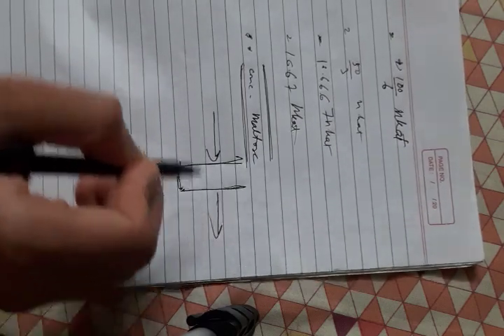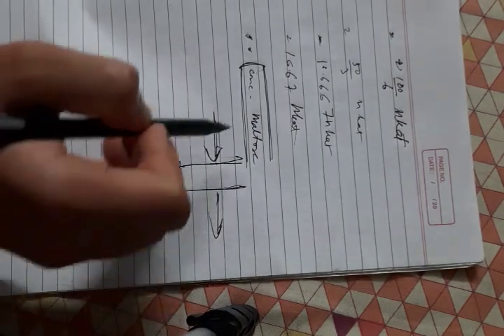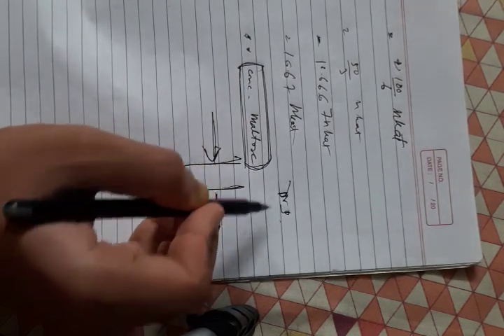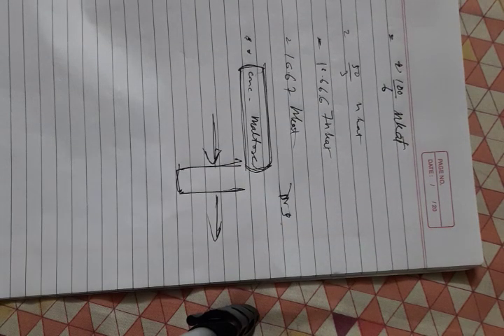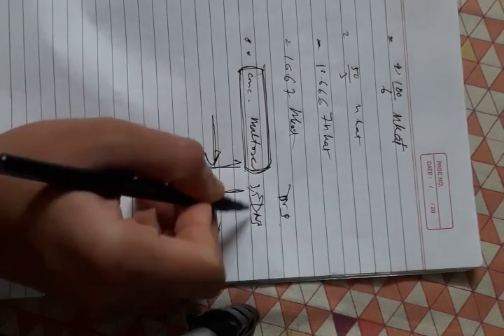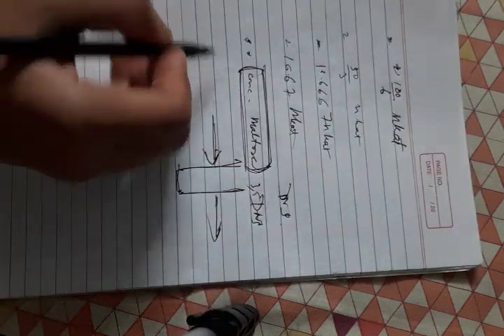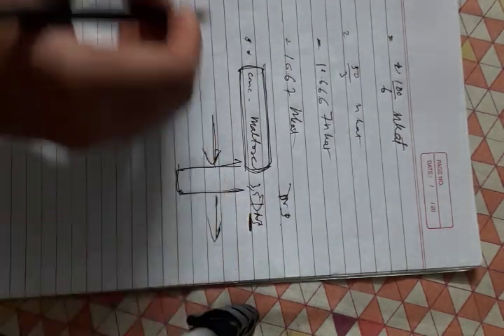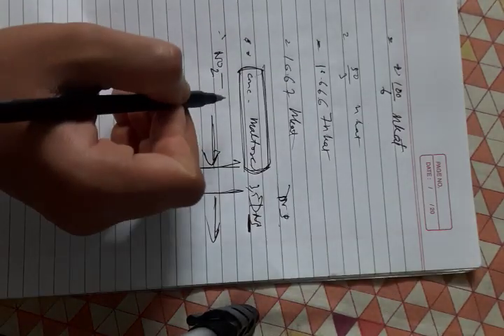a spectrophotometer. Okay, but why will it give a specific color? Well, for having a specific color, we use DNS. We know that maltose is a reducing sugar, right? And DNS is 3,5-dinitrosalicylic acid. I don't actually remember the structure of salicylic acid, but nitro is like this, right? I guess so. I don't remember these two well.